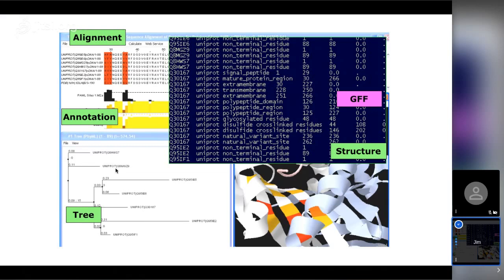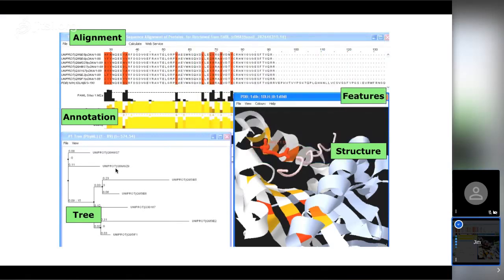Finally, GFF — also called generic feature format or gene feature format. We use it in Jalview to import and export annotation from the public databases which tell us about the functional regions of proteins and genes.